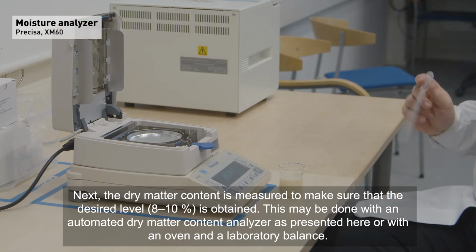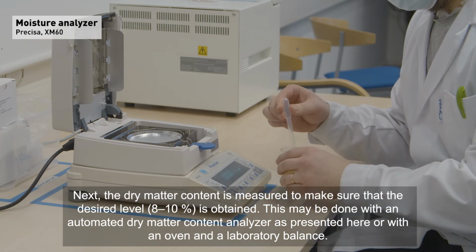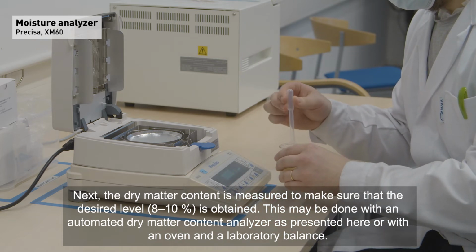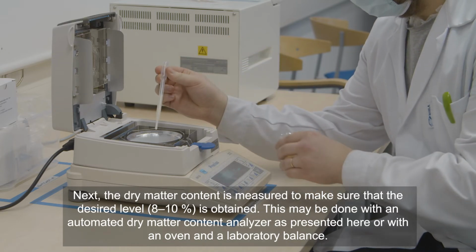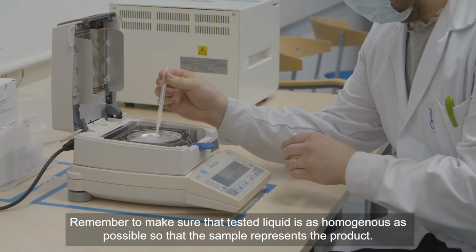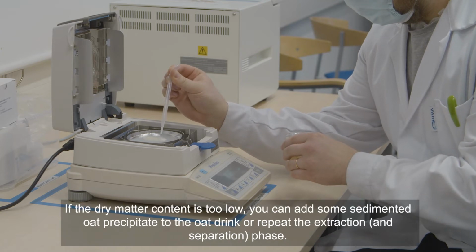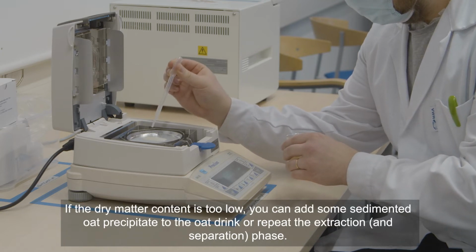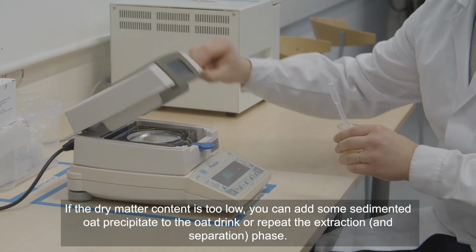Next, the dry matter content is measured to make sure that the desired level is obtained. This may be done with an automated dry matter content analyzer, as presented here, or with an oven and a laboratory balance. Remember to make sure the tested liquid is as homogeneous as possible, so that the sample represents the product. If the dry matter content is too low, you can add some sedimented oat precipitate to the oat drink or repeat the extraction phase.